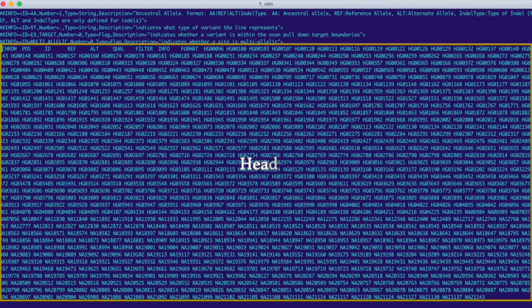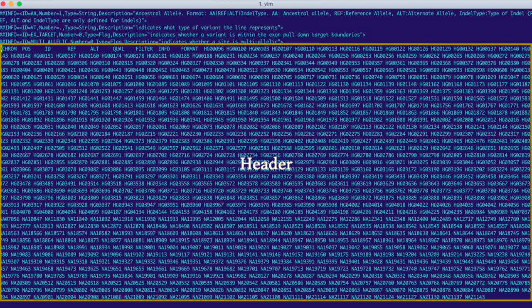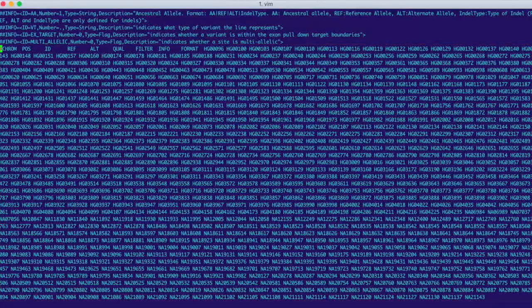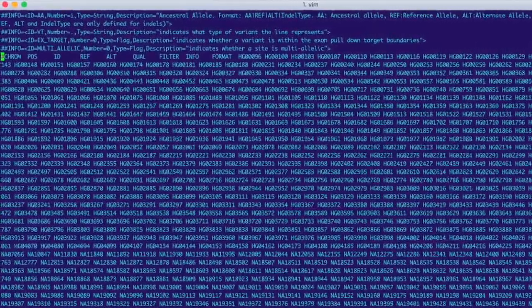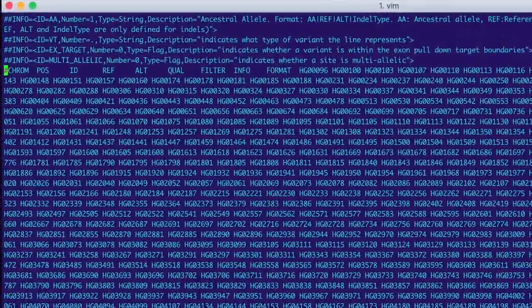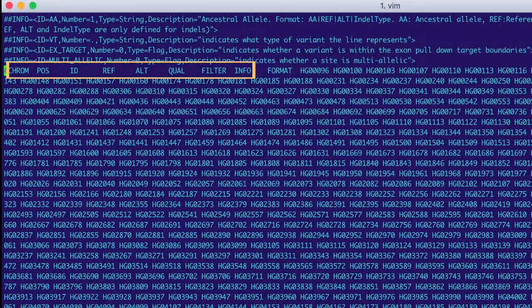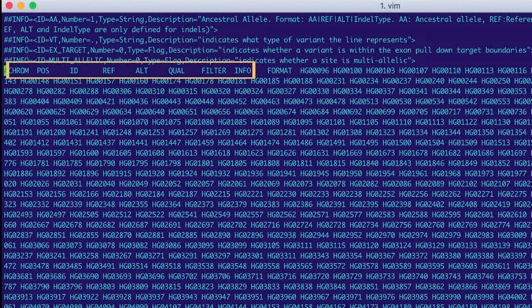Until we come to the header. Believe it or not, this is one line of data. It's just so long that it needs to be wrapped onto multiple lines. Each item in the header is a column in the VCF.